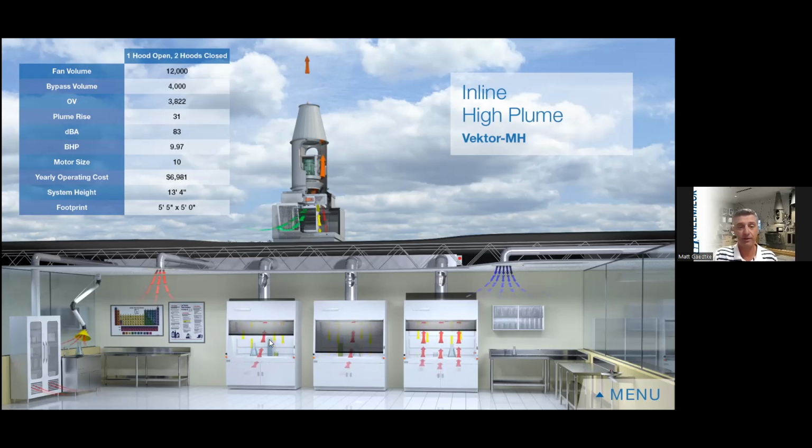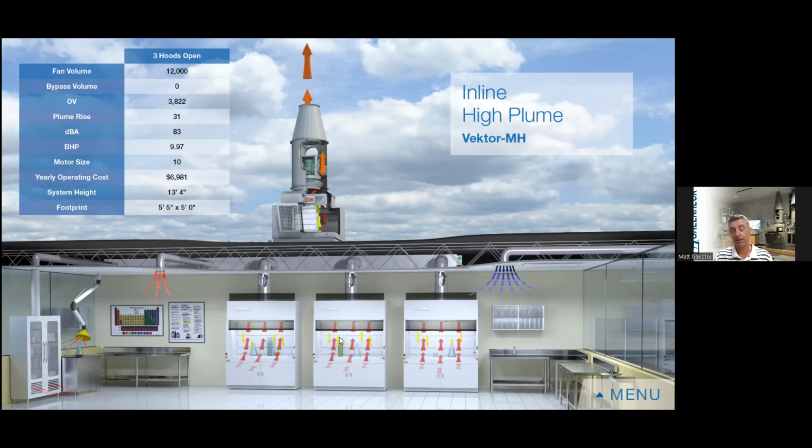You can see on all 3 of these, it all occurs the same. So that's my second control loop, monitoring and controlling that velocity. So a sash sensor, and it can also be a velocity sensor going through. So you'd have more of, I guess, a closed loop system in that particular case.